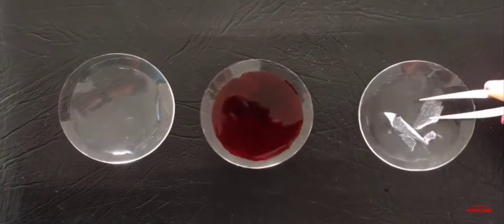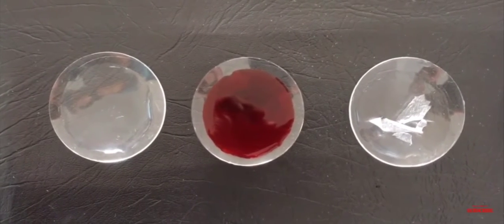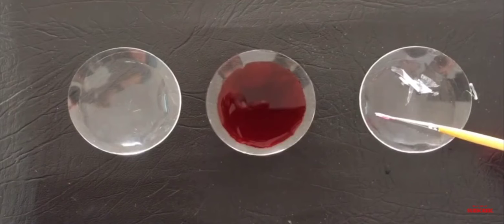So first we have to place it in the first watch glass which has plain water. Then take a small piece of it and place it on the slide, and take a drop of glycerin and put it over it and cover it with a cover slip. So in the second activity only this much has to be done in order to observe the onion peel cells without any stain.